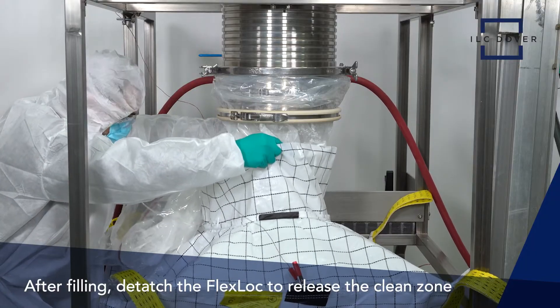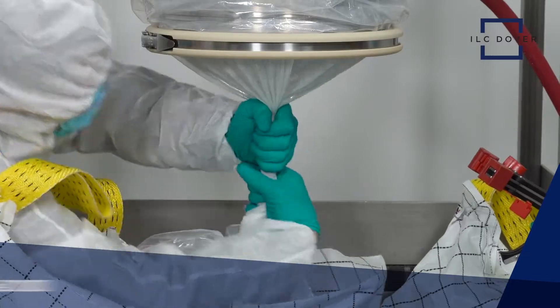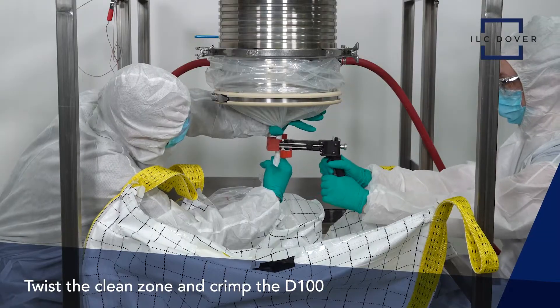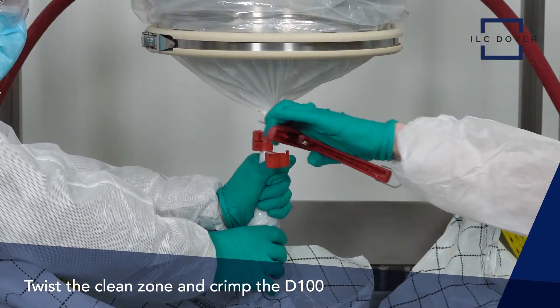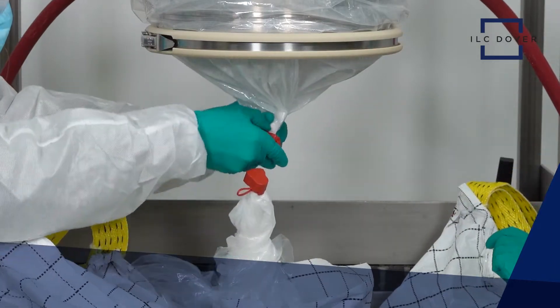After filling, detach the flex lock to release the clean zone. Make sure to reattach the flex lock prior to crimping. Twist the clean zone and crimp the D100. At this point, the bag can be transported within the facility to charge a reactor, sent to storage, or shipped to another location.